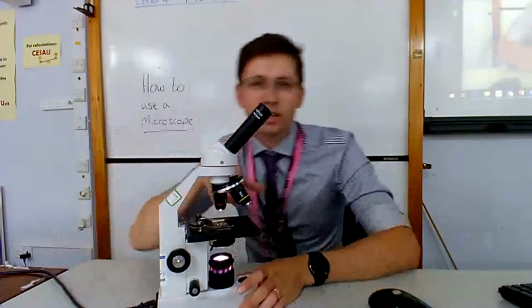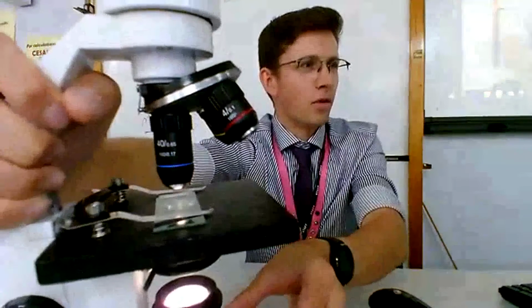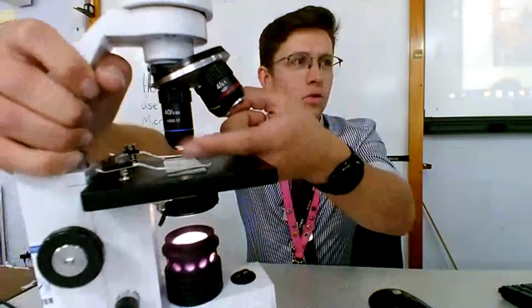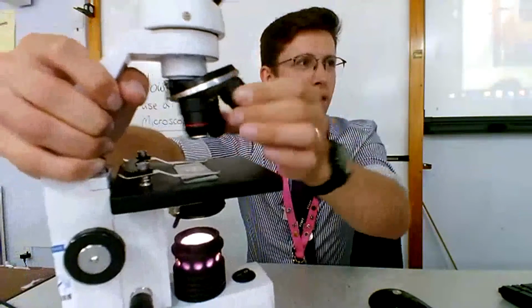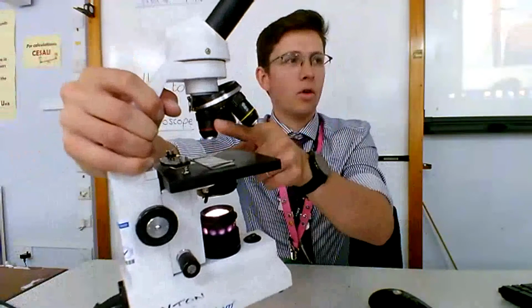Okay, so here, this one is 4 times magnification, because I don't know if we can see on the camera here. Can you see it says 4? All the students in my class are going, yes, but it's backwards. But on the video, it shouldn't be. So that's 4 magnification. Then we've got this one that's 40. And then if we can see the yellow one, oh, we can't because it's backwards. It says 10. The yellow one says 10. So I'm going to select my 4 magnification.